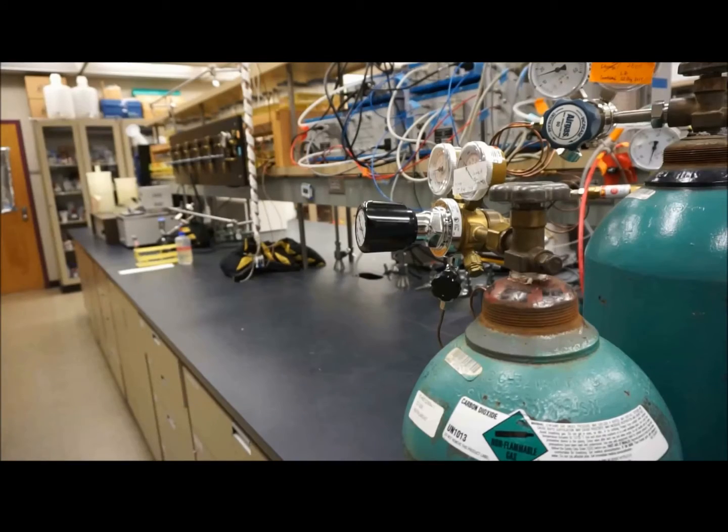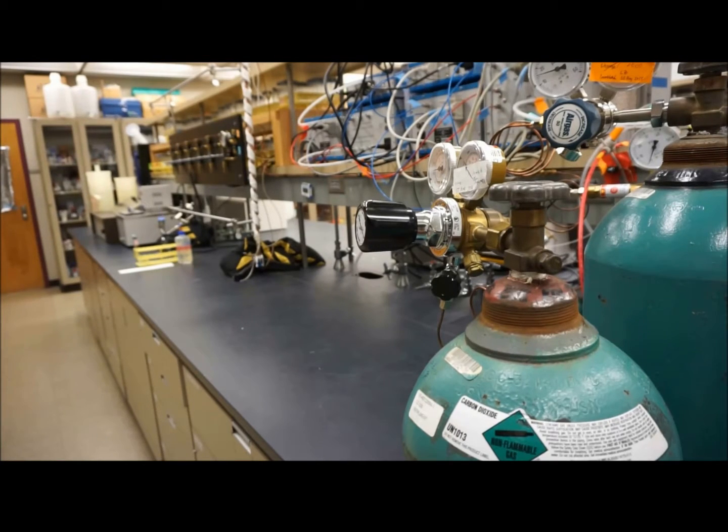This completes the transfer. We will turn off the gassing station, incubate the tube in a 39-degree incubator overnight, or until the culture grows. We will repeat this transfer when we want to start an experiment, or after a few weeks in order to maintain viability of the culture. Today we inoculate only 1 tube of media, but normally we inoculate at least 2 tubes in order to increase the volume and protect against tubes that don't grow.